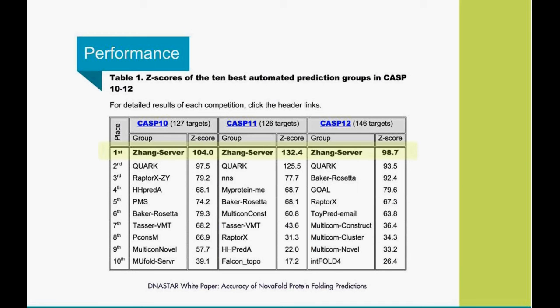It was really a no-brainer for DNASTAR to partner up with the University of Michigan to commercialize this application because we feel that you have the biggest advantage when starting with the best structural model for the design of your future experiments.